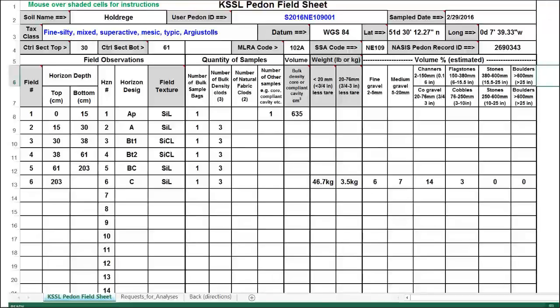And a lot of people have not done that. I think it's largely because they don't understand, but it'll be on the tag, and you fill it in on the tag, write it on the bag, and then also here in this column. That's a fail-safe for making sure that they're labeled right and in the right sequence, and in helping the people that unpack it to make sure they're all there and arrange those for logging in.